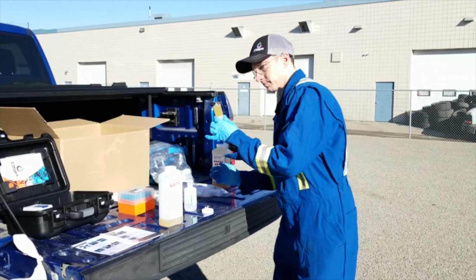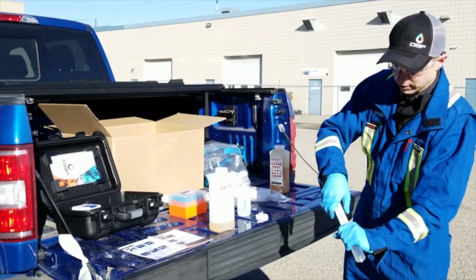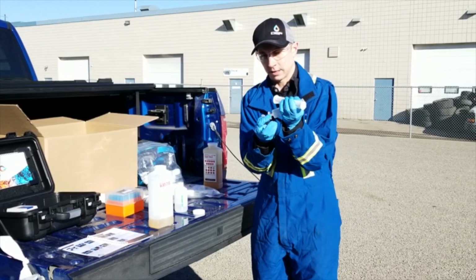Detach the filter, get rid of the remainder that's in your syringe, take the syringe plunger out, shake it, and reattach the filter. Again, it just screws on.